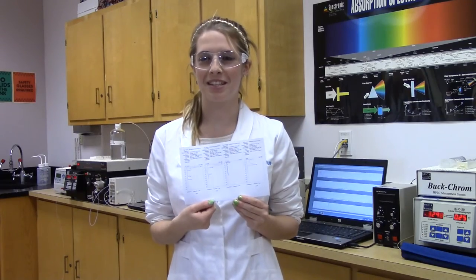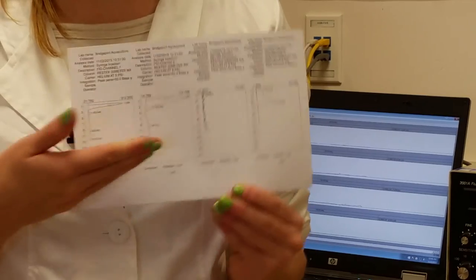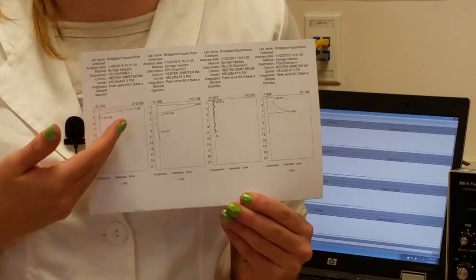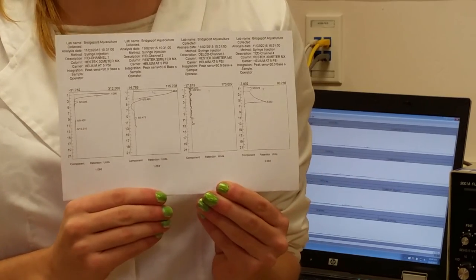So this is what it should look like when the scans are complete. If you'd like to make it bigger or get rid of one of the detectors, you can do this in the computer. Thank you so much for watching the video and please stay tuned for the other videos coming soon.